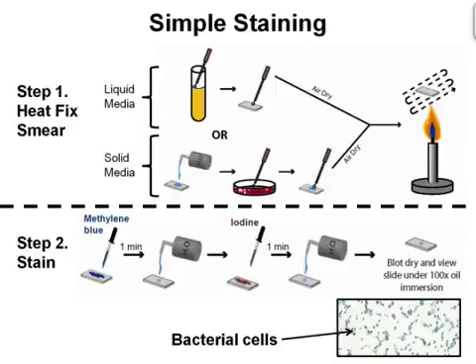Pick up the slide by one end and hold it at an angle over the staining tray. Using the distilled water wash bottle, gently wash off the excess methylene blue from the slide by directing a gentle stream of water over the surface of the slide. Wash off any stain that got on the bottom of the slide as well. Saturate the smear again, but this time with iodine. This will set the stain. Wash off any excess iodine. Blot the slide using bibulous paper. It is important not to rub the slide; rather, place the slide between 2 sheets of bibulous paper and press down gently. This will preserve the organisms on the slide and the paper will absorb any excess dyes.